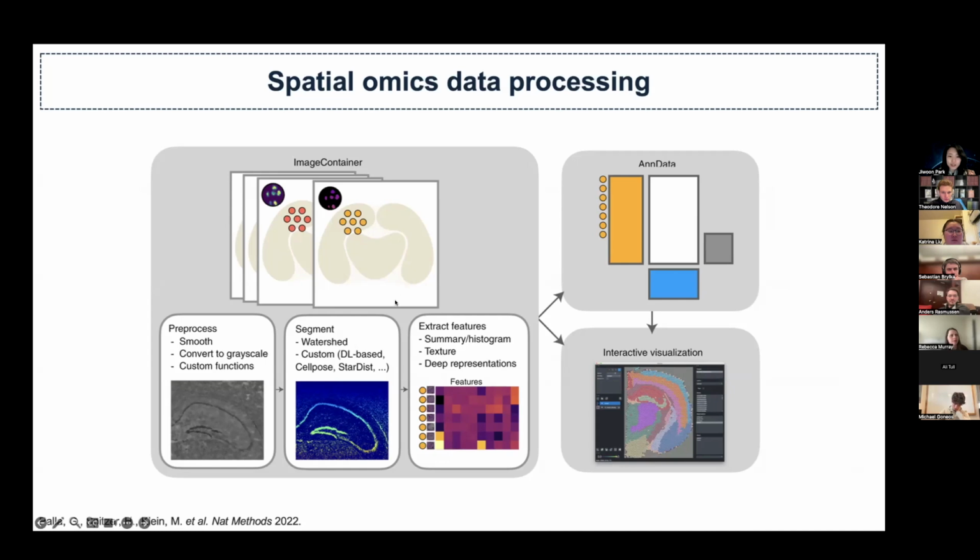I'm not sure how many of you are familiar with AnnData or Seurat objects. Awesome. I think it's almost half and half. AnnData is a more common format for single cell or spatial datasets in Python, and Seurat is the more familiar type for single cell or spatial if you're an R user. Because these datasets are complex, when you collaborate with other collaborators, we also tend to build an interactive visualizer or image viewer so that we can always go back and forth on the image-level information, which I'm going to show you a little bit later.